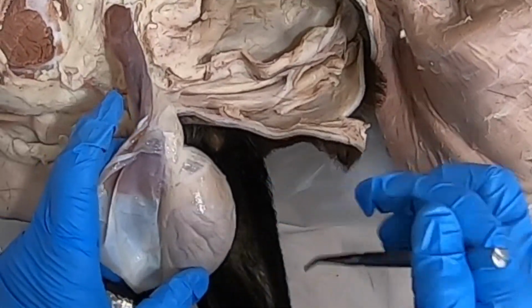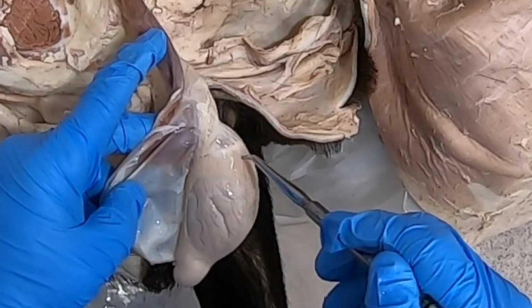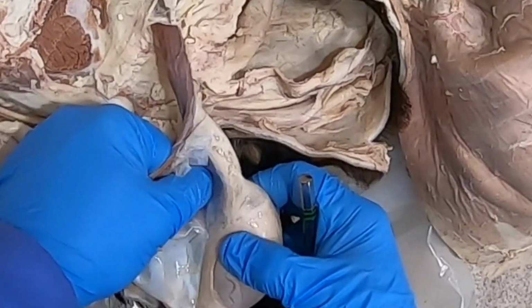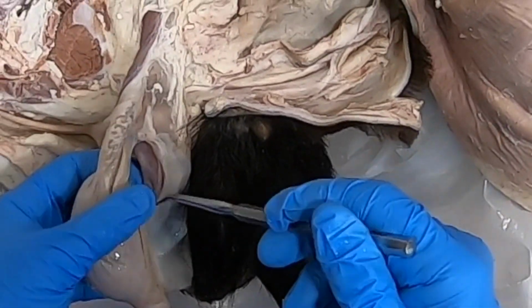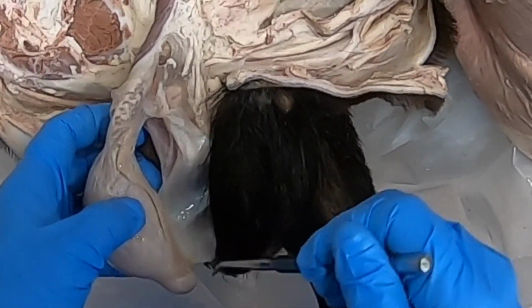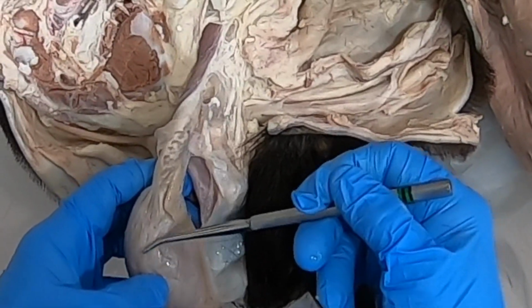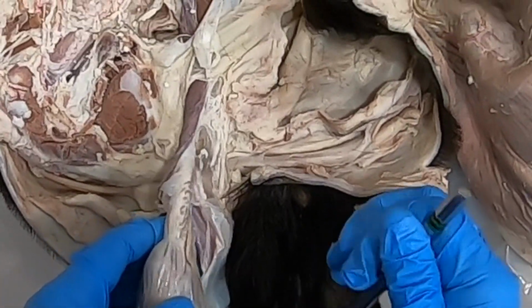Here we can see now the head, the body, and the tail of the epididymis. So we have a very close attachment here from the visceral to the parietal vaginal tunic. This shiny surface is visceral vaginal tunic, and that's parietal vaginal tunic.